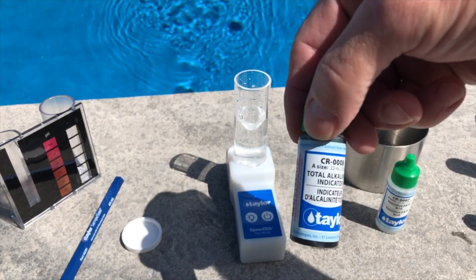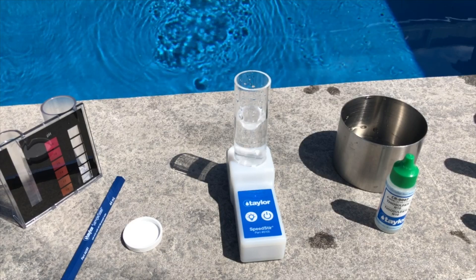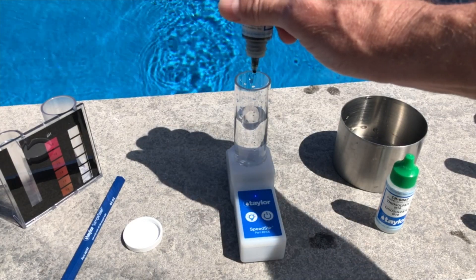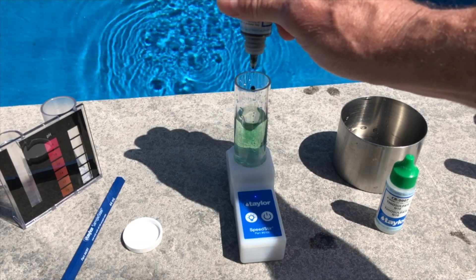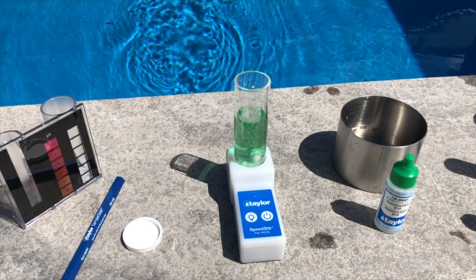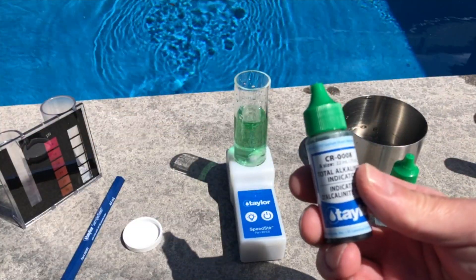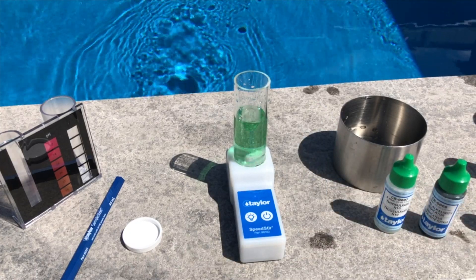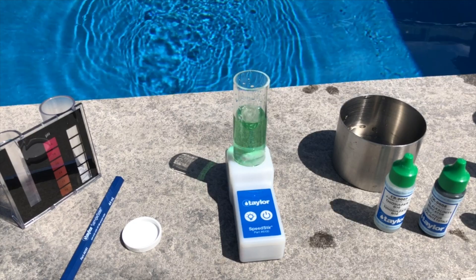The next one is our total alkalinity indicator. This is actually made up of two indicators — bromocrysol green and methyl red. We're going to add five drops of the indicator, and the sample will turn green. There we have it — the sample is green, and that's the total alkalinity indicator.